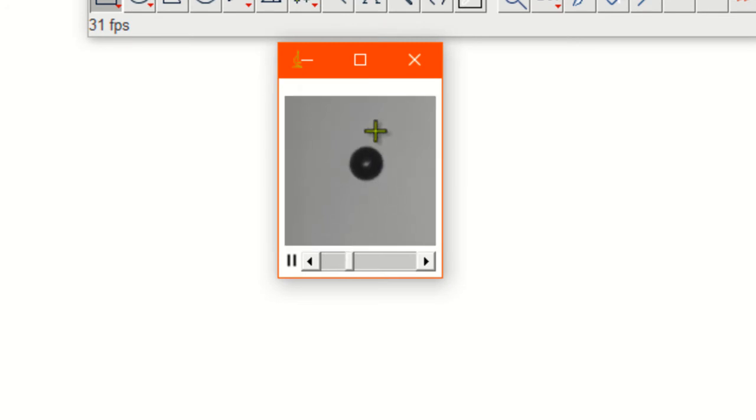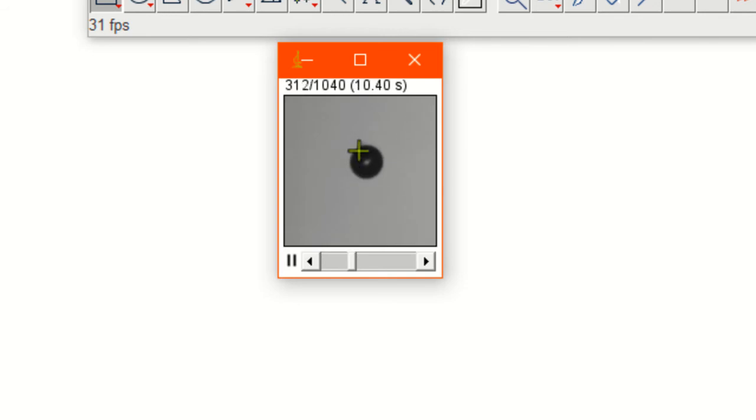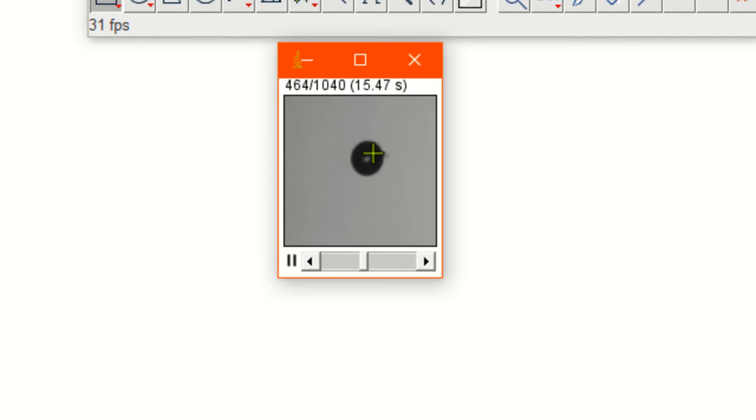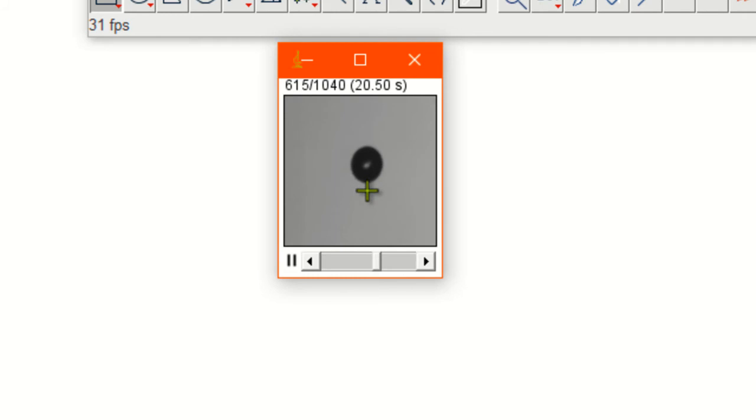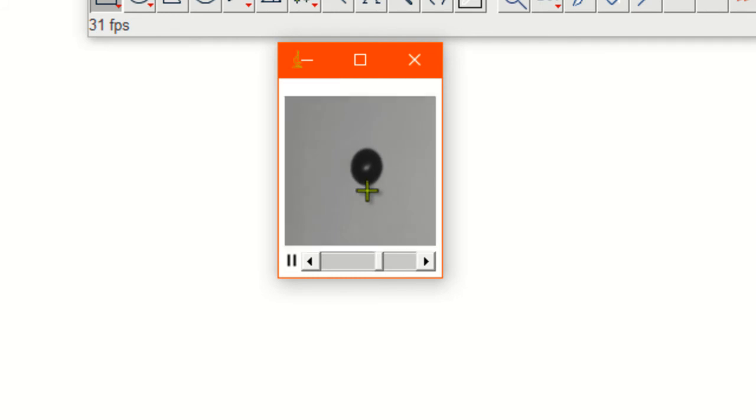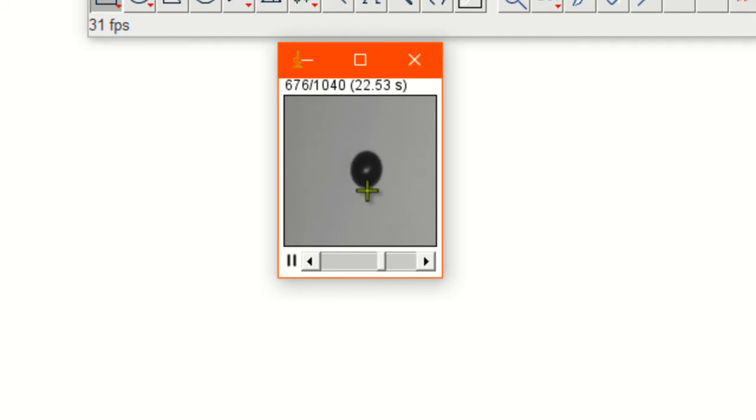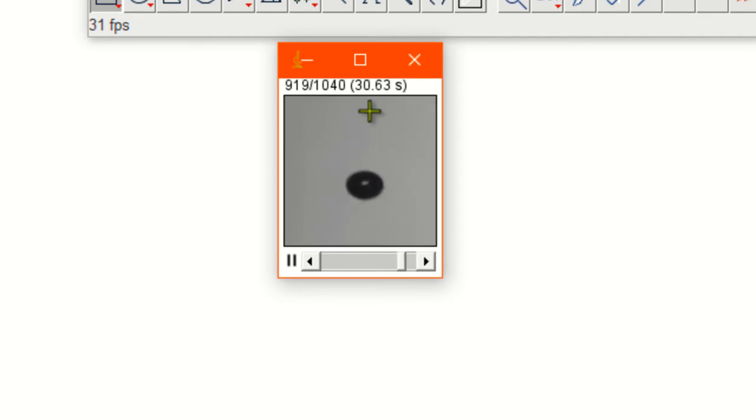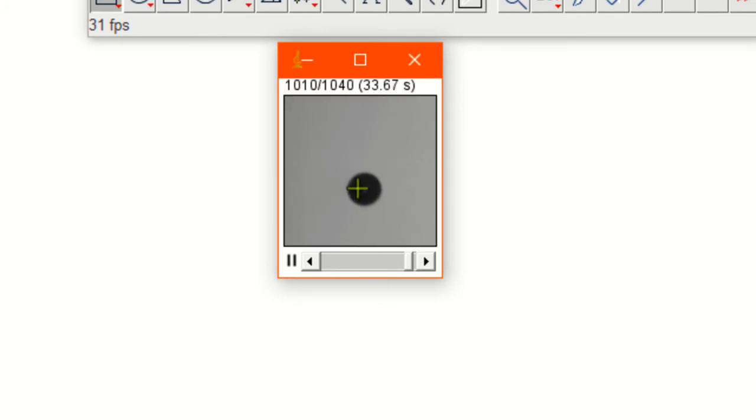This is the video. You can see how the droplet is oscillating, how its center of mass is moving upward and downward. Now it's coming back in the downward direction, and simultaneously it is deforming.